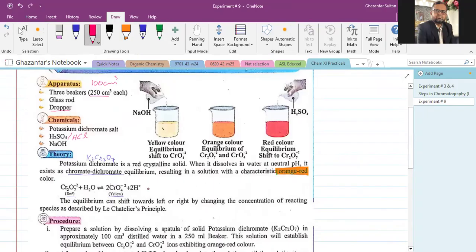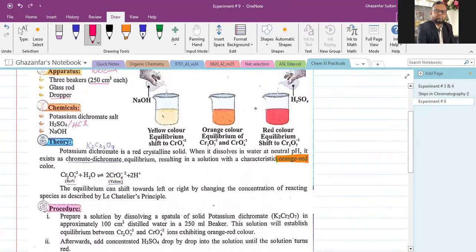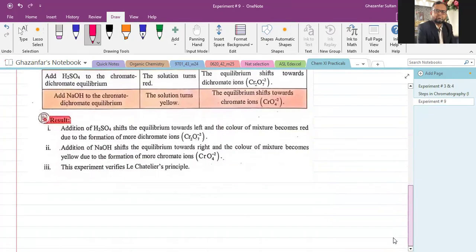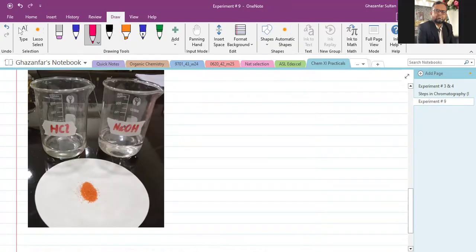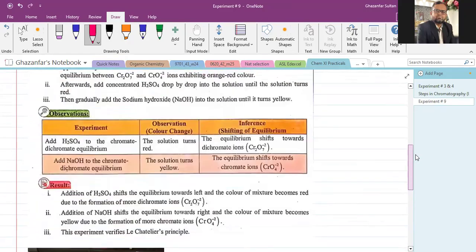The equilibrium can shift left or right by changing the concentration of reacting species. We can easily change the concentration of hydrogen ions by adding acid or sodium hydroxide, as we will see. Looking at the diagram: we have two beakers — one containing HCl and one containing sodium hydroxide — and potassium dichromate(VI) in solid state, K₂Cr₂O₇.